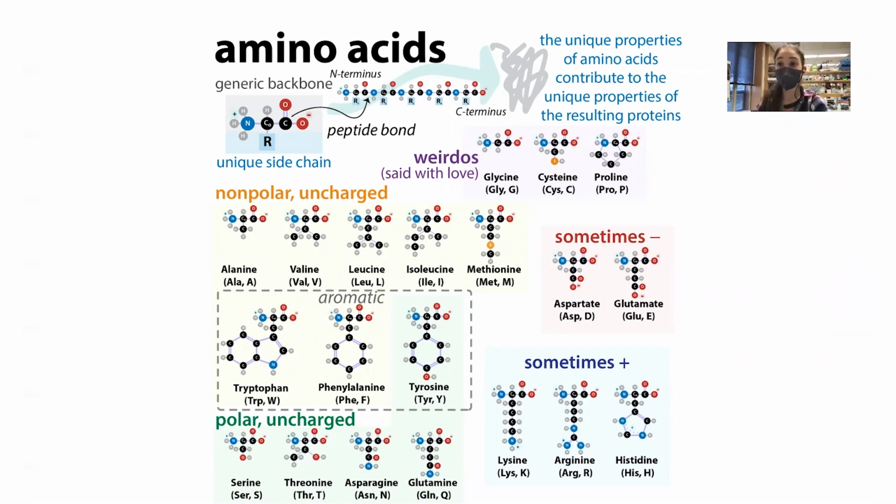There's also high throughput manners of deep scanning, where you change to different amino acids, all sorts of things, in a high throughput manner. Not going to go into that, but that sort of thing does exist. But typically, I'm working with things where we have some idea that a specific amino acid is important. So often, we even might hypothesize about what part of the amino acid exactly is important.